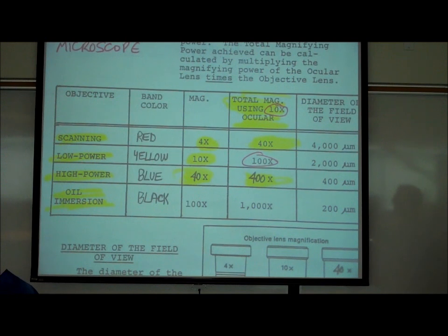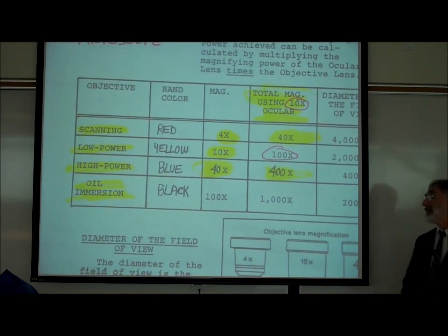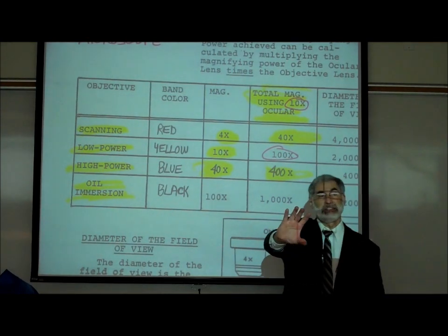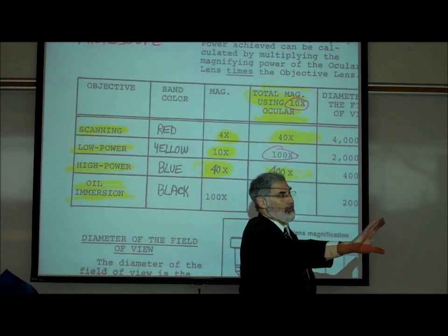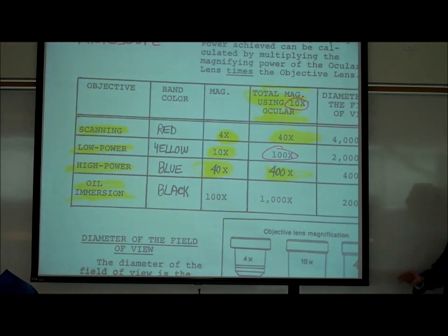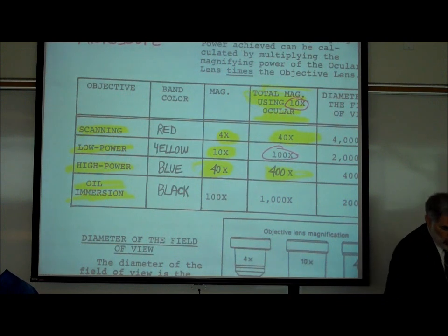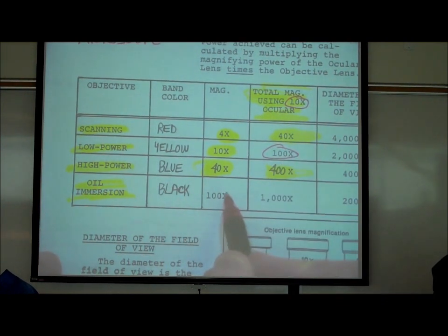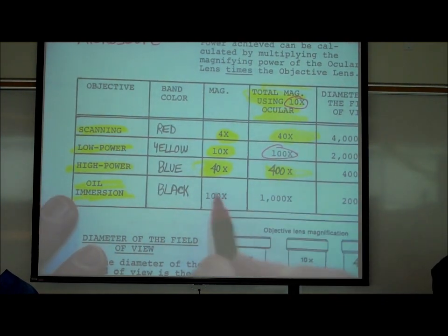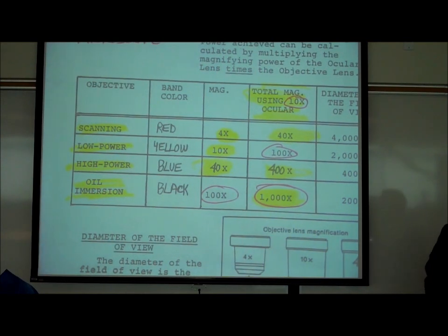That means whatever you're looking at is 400 times bigger than it really is. The longest lens, with the black band, has the number 100 written on it. When you click it into place, your total magnification is 10 × 100 = 1,000x, making something appear 1,000 times bigger than it really is.